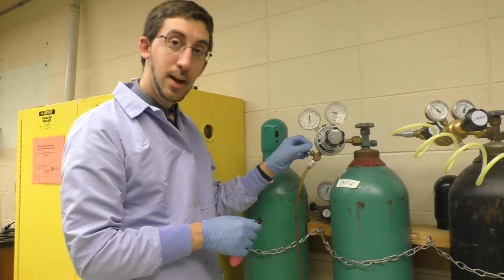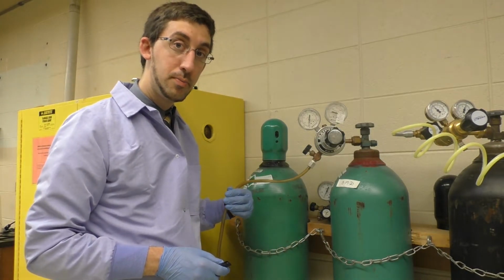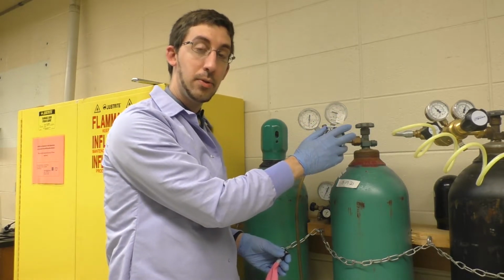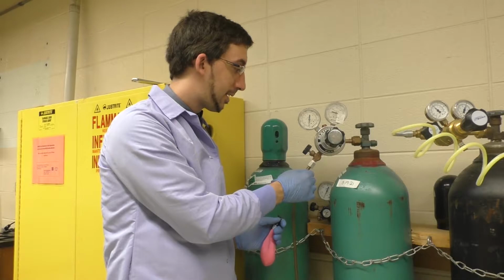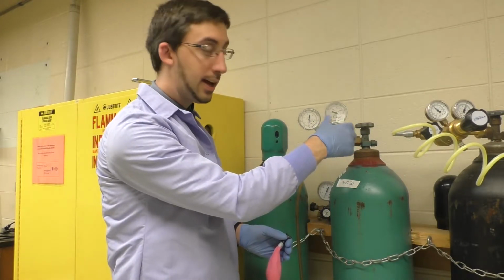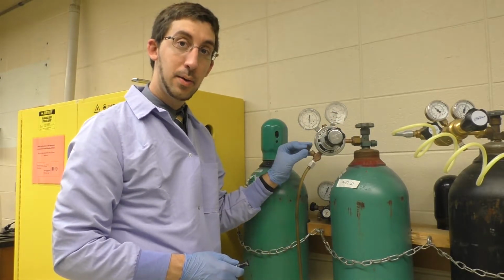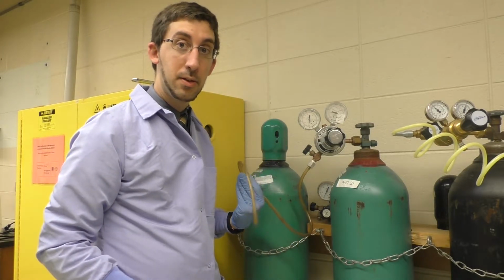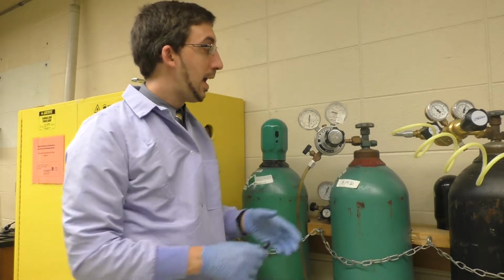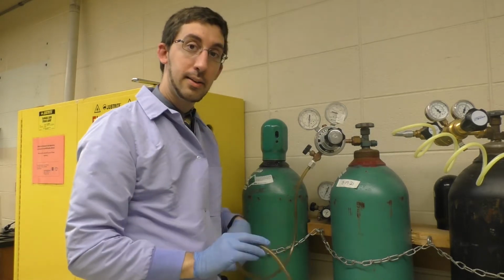This one simply opens up the valve here to allow gas to flow out of the tube and out of the tank. But this dial here adjusts the pressure coming through that tube, essentially how fast and how much gas is coming through the line. And so if I have this all the way dialed out, then you'll notice that I currently have no pressure. So if I were to open this, I would have essentially nothing coming out of the tube, even though the tank is open. But I can screw this in and adjust it to allow for gas to flow.